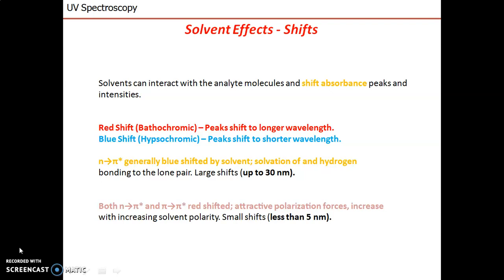But when paracetamol is not fully dissolved in water, it is not showing that much proper absorption, and it shows its lambda max at another wavelength. And in HCl, it is also not very stable, so it shows lambda max at another wavelength, as well as the absorption maxima is shifting, and the amount of absorption is also shifting due to the solvent effect. So first is the red shift. It is also called bathochromic shift.